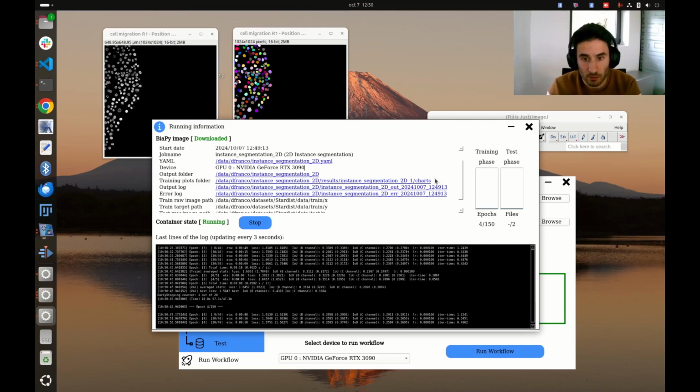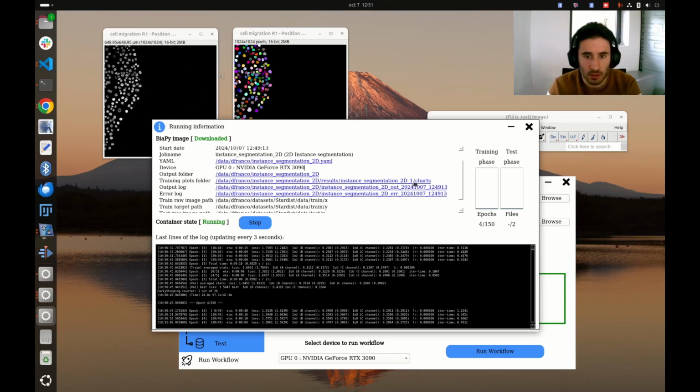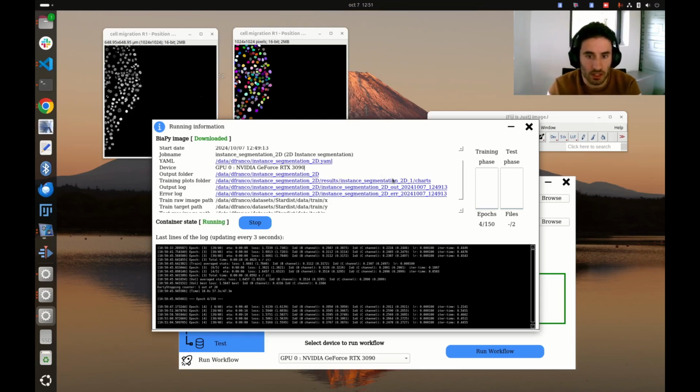In case you want to check them, after every 5 epochs by default, some charts will be created or updated.